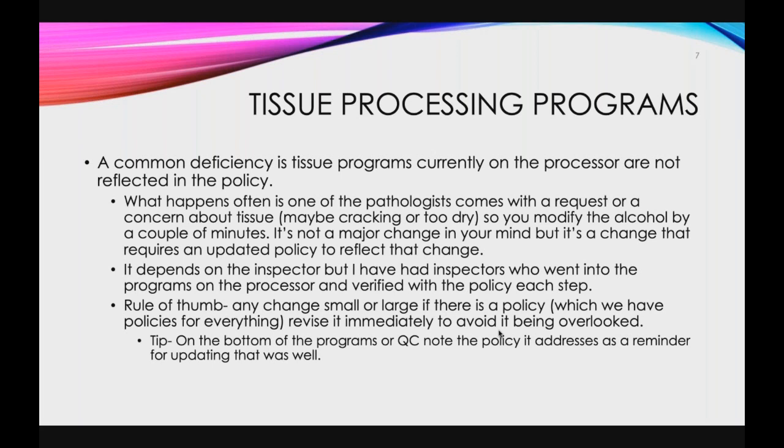What tends to happen, like all of us know, is some pathologists will come and say, I don't like the way that this tissue is looking. Maybe something is wrong with the tissue processor. We don't know if it was just, I have an Excelsior and a VIP. So sometimes when it's fresh alcohol, it tends to be a little dry. They tend to be a little cracked. We have a breast pathologist who always complains that the breast is a little fatty.